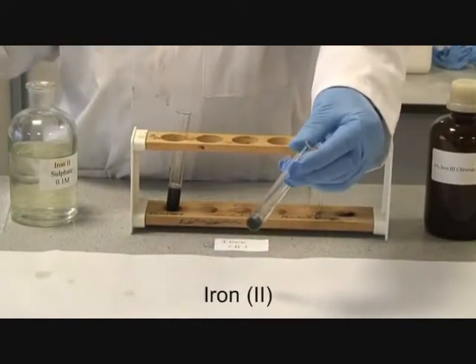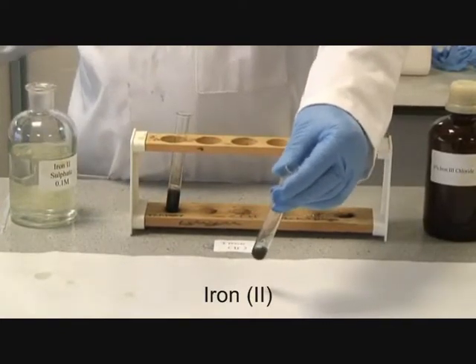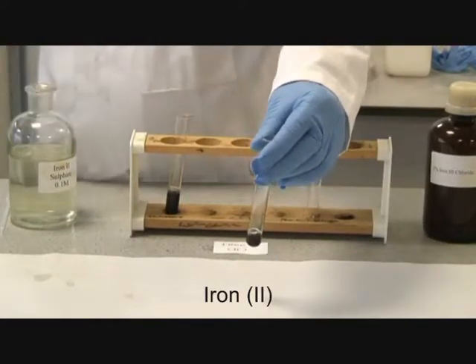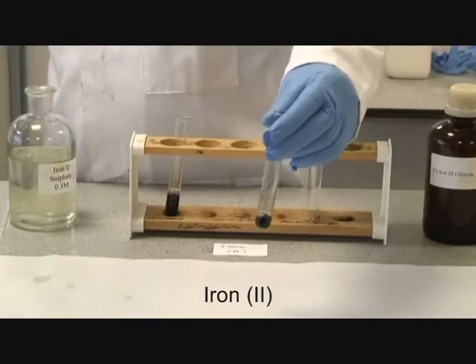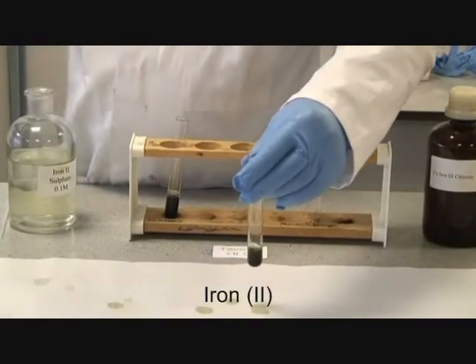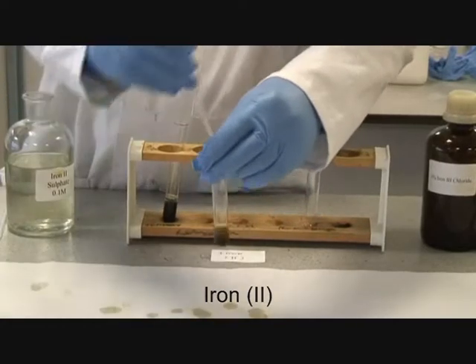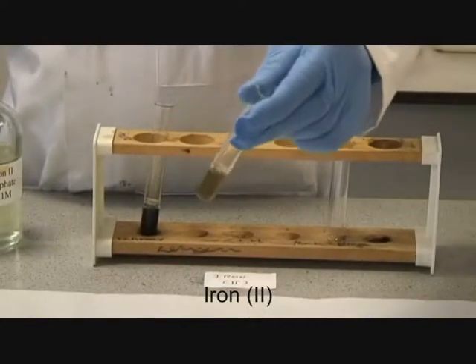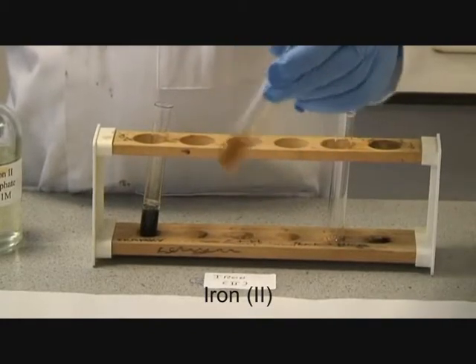Again, a brown-green precipitate is formed. On the addition of excess ammonia, the solution clarifies and turns brown.